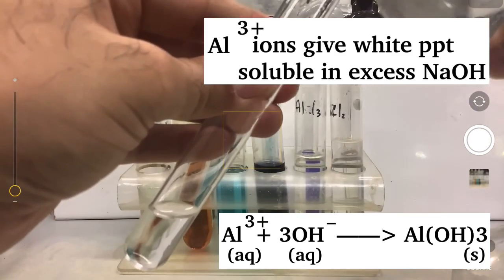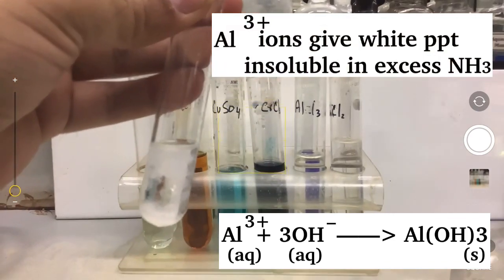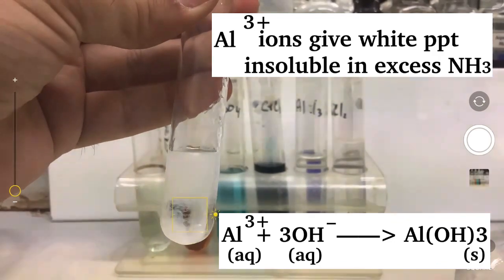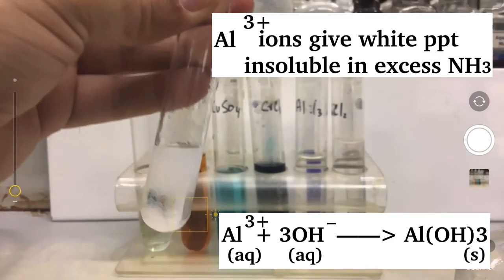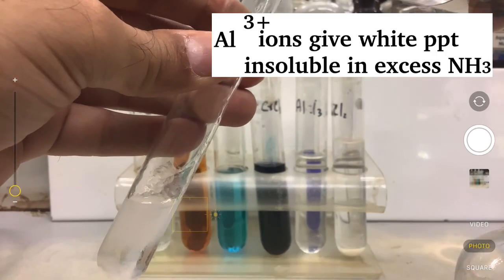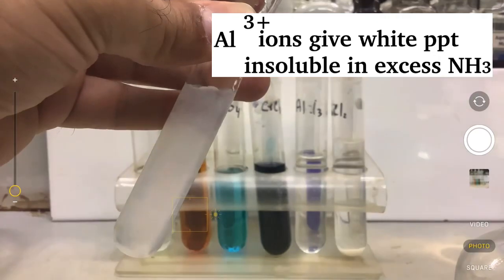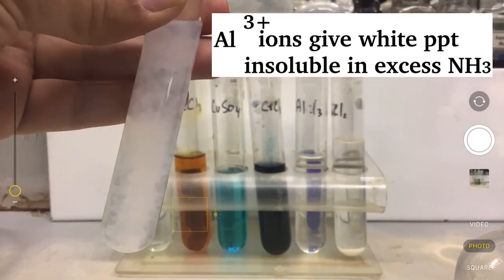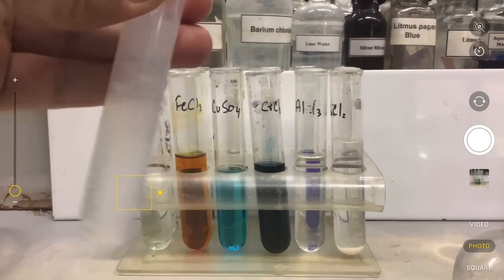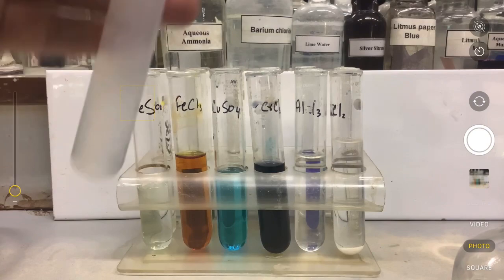Now I will perform a similar testing using aqueous ammonia on the aluminium sample. It says aluminium ions give white precipitates insoluble in aqueous ammonia. So when I add excess aqueous ammonia in those white precipitates, they will not dissolve. So this is another distinguishing feature. White precipitates of aluminium hydroxide do not dissolve in aqueous ammonia, but they were clearly dissolving in sodium hydroxide.